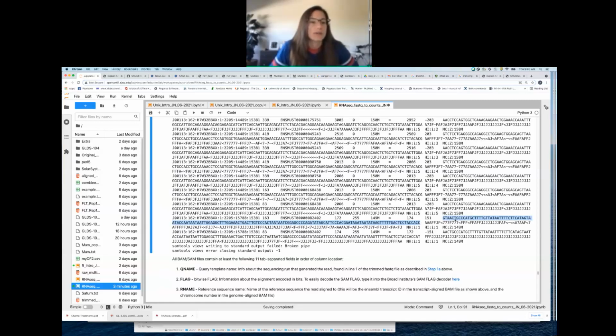How do we know it's mapping to different parts of the genome and not the same part of the genome, but just different transcripts? So you're saying the splice isoform, so the same gene, but we're looking at a splice isoform. Is that what you're asking? Yeah, good question.